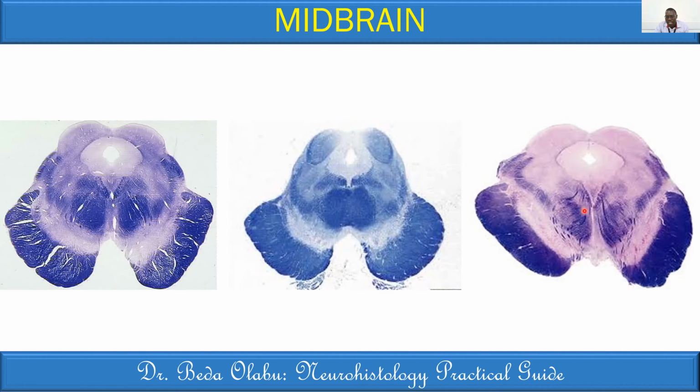Great, you can see some nerve coming out ventrally there. So this should be the third cranial nerve coming out. That's the oculomotor nerve coming out. This is the lemniscal system. Remember that we have several lemniscal systems: medial lemniscus, lateral lemniscus, spinal lemniscus, and trigeminal lemniscus. So we have all of them there, apart from perhaps the lateral lemniscus that is not within that particular region.